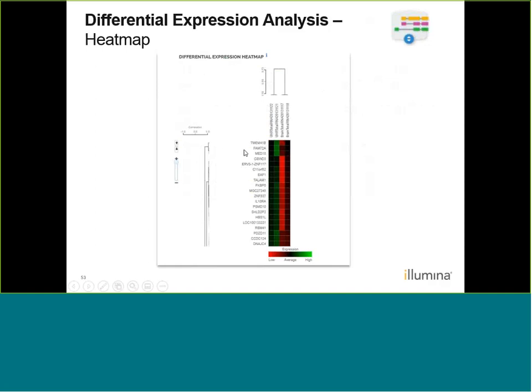And similarly, we're going to have the same thing for our genes. So up at the top here, these 2 genes are creating one cluster, but since there are many, many genes, you're going to have a lot of different clusters, and they're going to be clustered based on how similar they are in this analysis. And then, of course, we have our color coding, so we can see here that this top gene for the UHR sample here is highly expressed, and there's low expression for this brain sample and average expression for these other two.